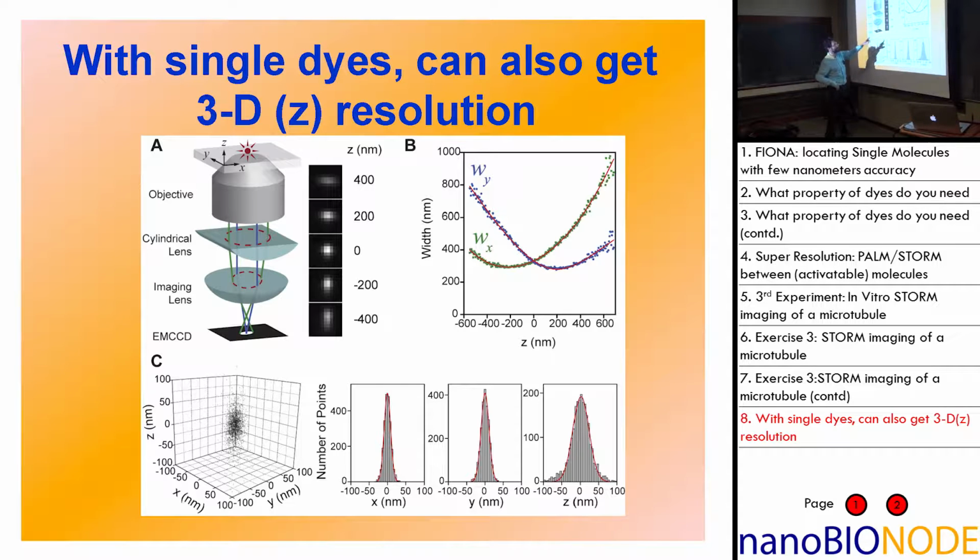So you can take the X and Y dimension, and it turns out the more you move it out of your plane, the more the Y dimension will get. Now that's assuming that you moved the Z-axis, in this case, like minus 400 nanometers.